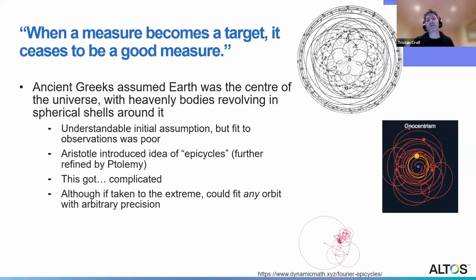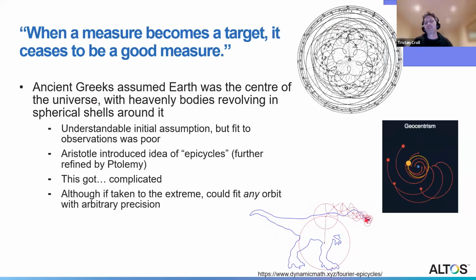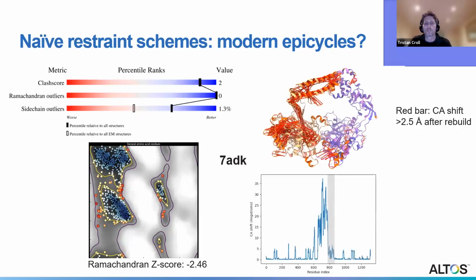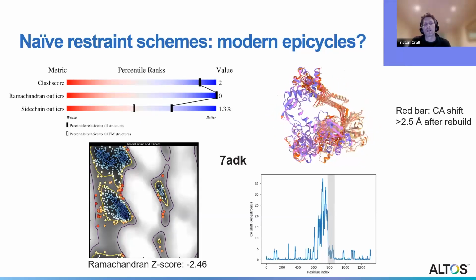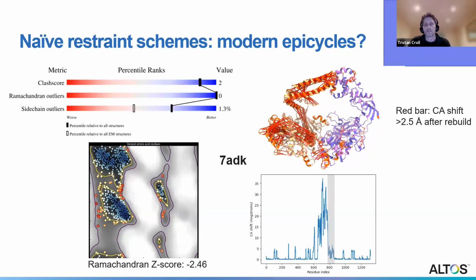Really quick. Okay. So the point of this was that people used epicycles to try and force fit observations to data. And honestly, that's more or less what we're doing today with a lot of the restraints, and I worry that that's what I'm doing sometimes as well. The worst case of that is this model from a few years back now, which passes most of our validation criteria with flying colors, but is disastrously wrong when you look at the details. There are huge areas massively out of register. And so we really need to start rethinking this very, very carefully.